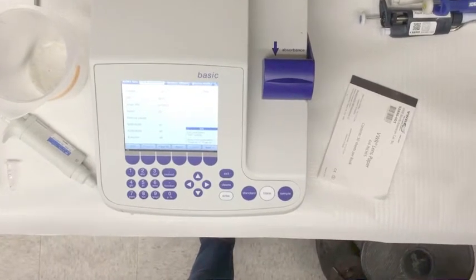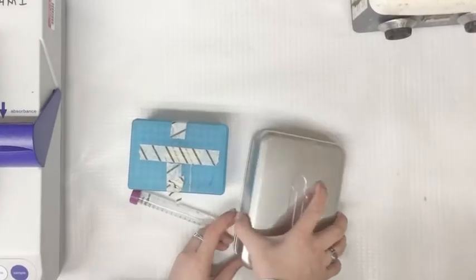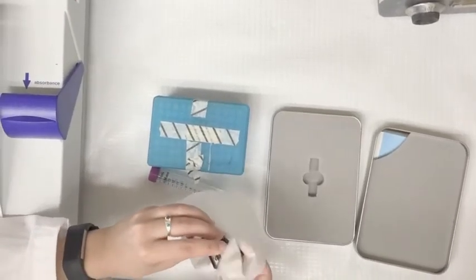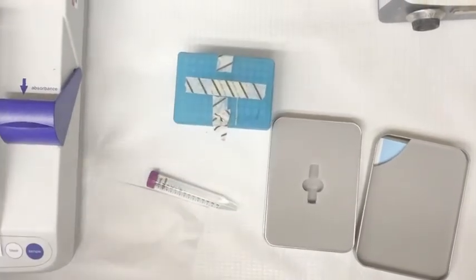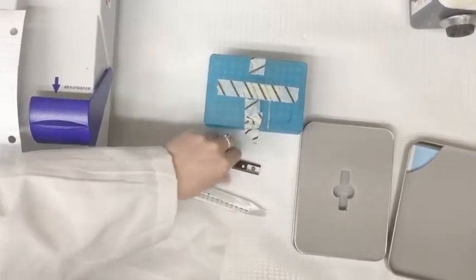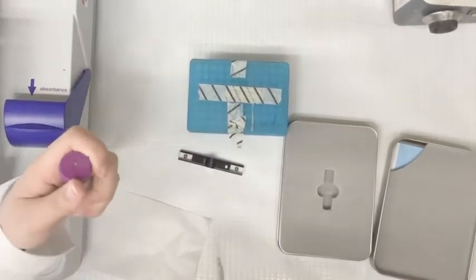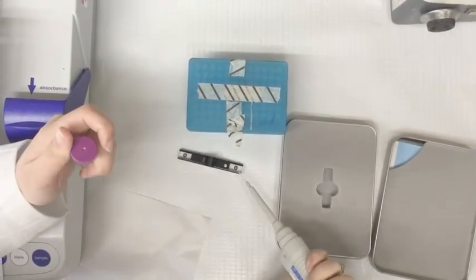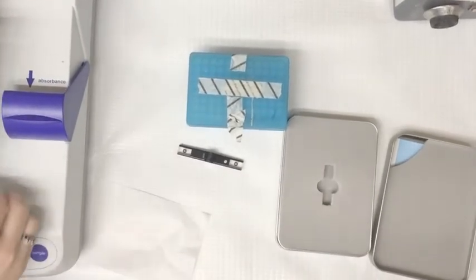You are now ready to begin the process. Next, take the quartz cuvette out of the container and wipe it down with lens paper. After that, you are going to add your blank sample. Add 1 to 2 microliters of TE Buffer to the inside of the black circle.